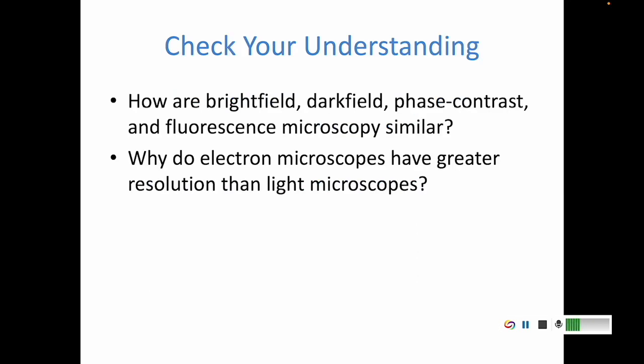So at this point, you can tell me, how are brightfield, darkfield, and fluorescence microscopy similar? We took out phase contrast, so don't worry about that one. And then, why do electron microscopes have greater resolution than light microscopes?